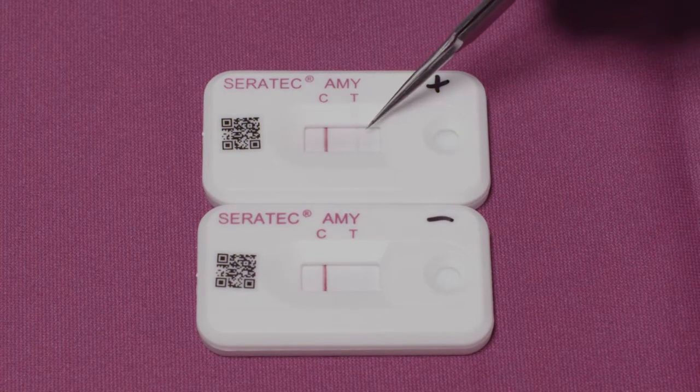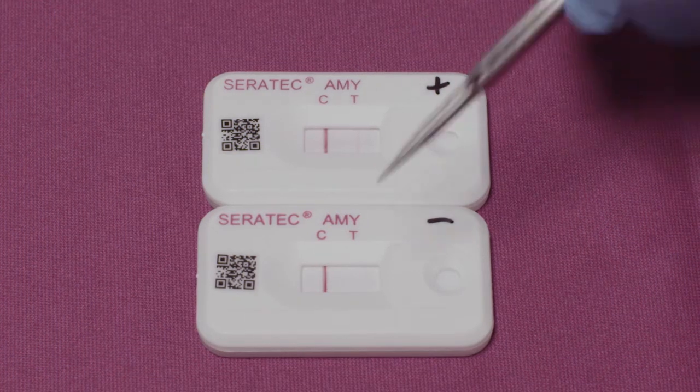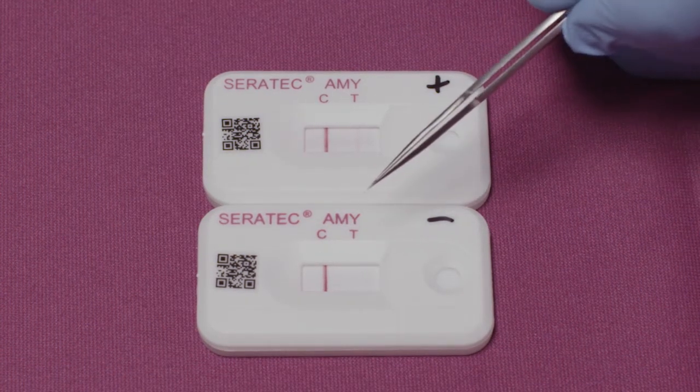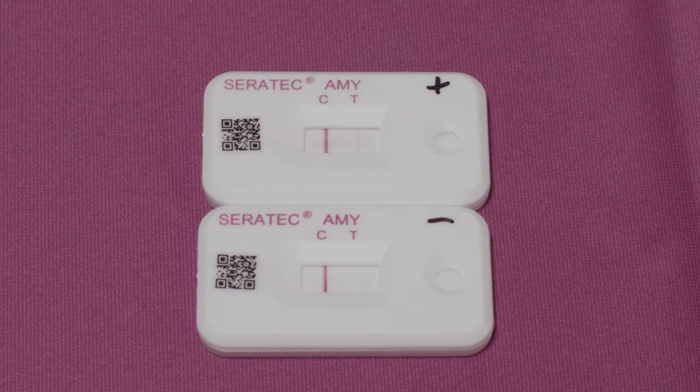A positive result will show two lines. A negative result will show one line. If the control line does not develop, the result is invalid and the test should be repeated.